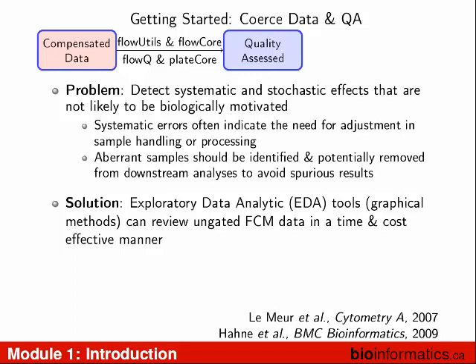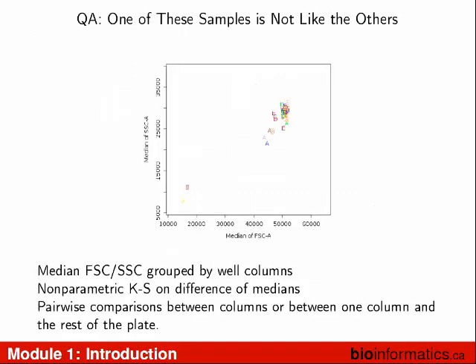But there's no p-values associated with that, so you do a lot of exploring based on what's different from one sample to the other. So there are tools to do that, just to explore data. There are two papers that have been published that describe some of this. And we do things like this.